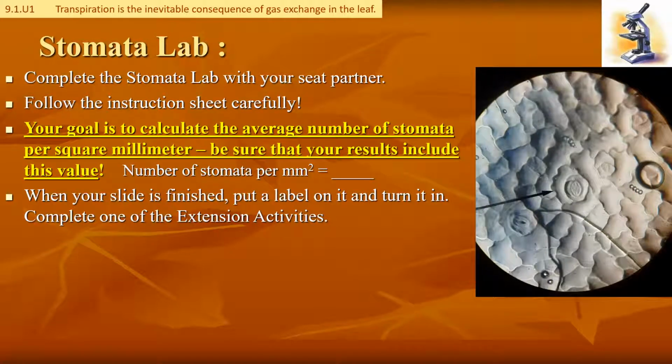Today, when you're finished with your slide, you're actually going to turn it in to me, which is something that you haven't done before. And then you're going to choose one of the 2 extension activities with your partner. You're going to design your second idea for a lab that you could do that incorporates this technique that you learn in the first part of the lab.